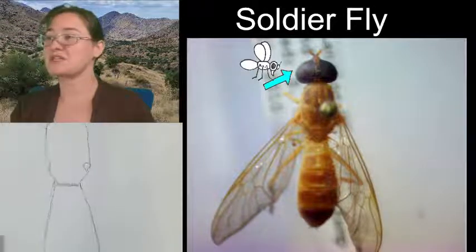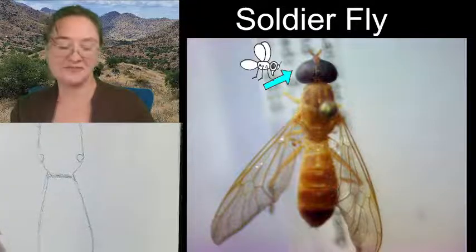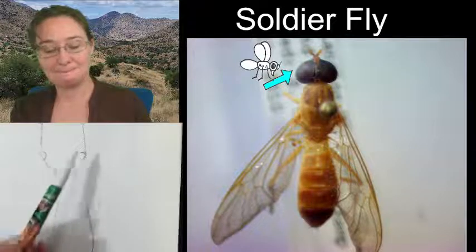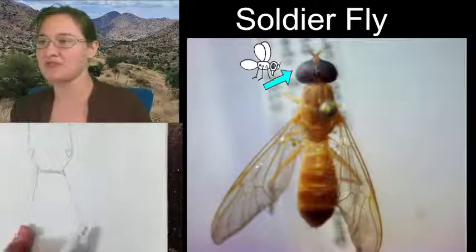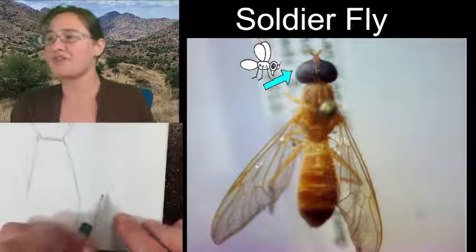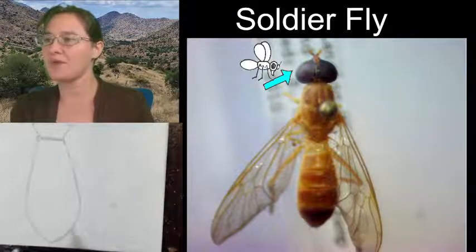That also means that my wing is going to go off of the page. Whoops. What I think I'll end up doing is drawing the wing the proper size over here, and then I will have the characteristic cell, that closed D cell, on my paper.